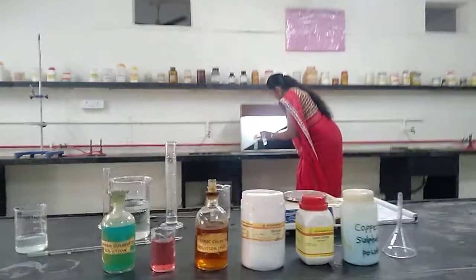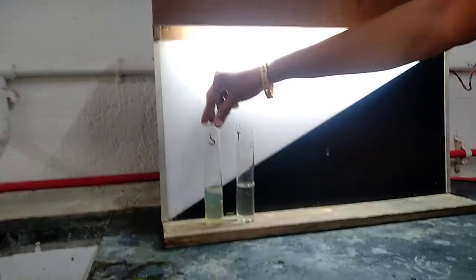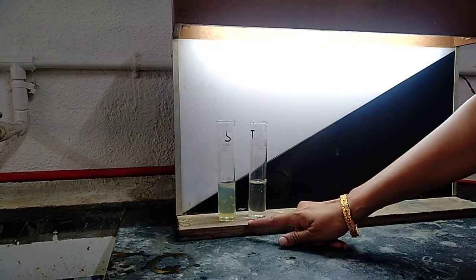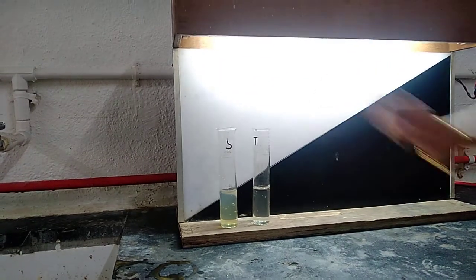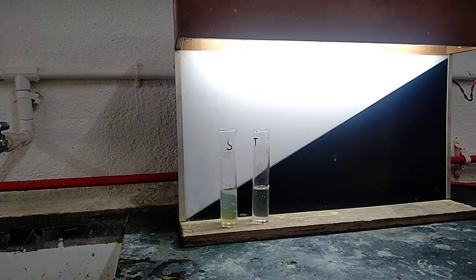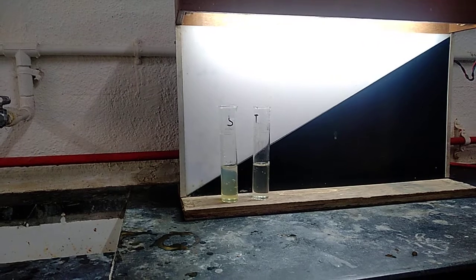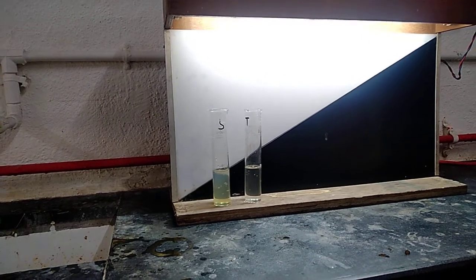This is the standard solution. That is showing somewhat brownish color, while the test solution is colorless. That indicates that this dextrose anhydrous is suitable for the preparation of parenteral.